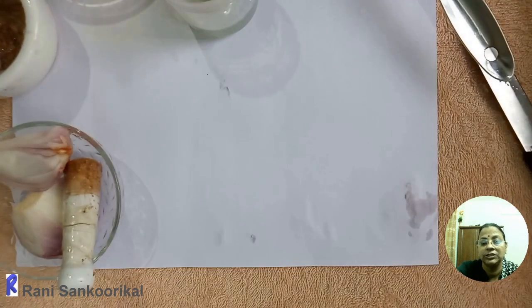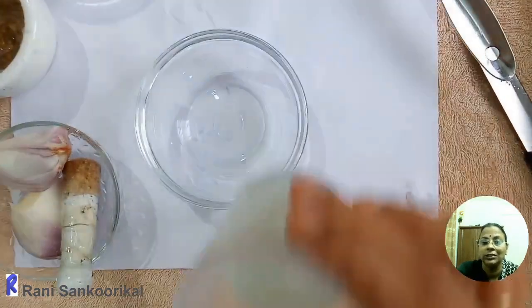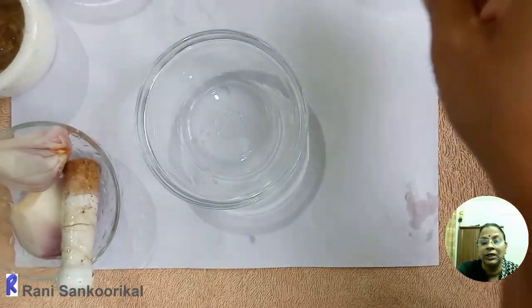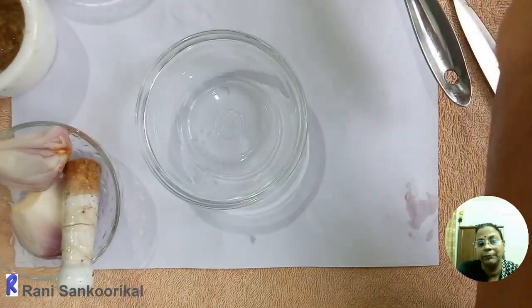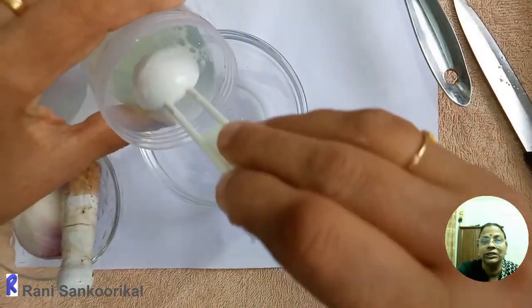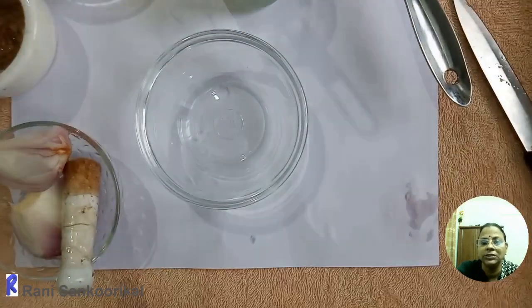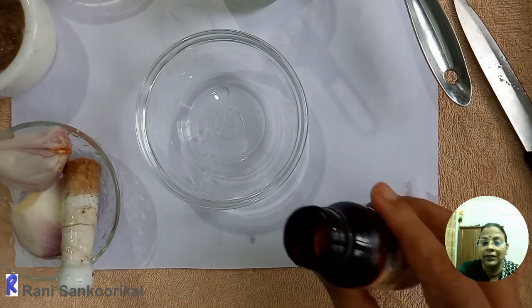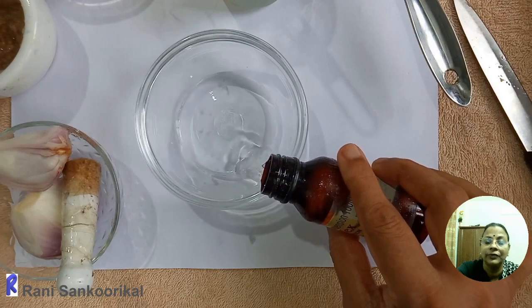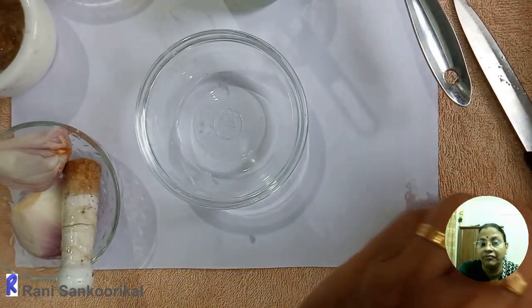After that, we can take a petri dish or a bowl or even a test tube. Students can usually use the test tube, and while demonstrating, teachers will use the petri dish. First half fill the petri dish. Make sure that the onion extract is free from bubbles. Then take the chilled ethanol and half fill the bowl with ethanol, half fill only.